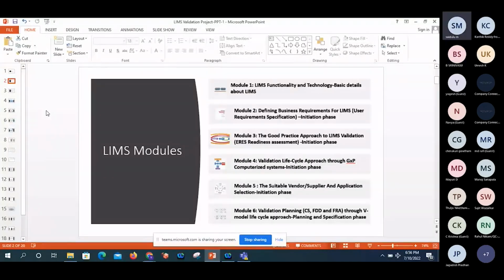Not V model. Nowadays they are asking in interviews at Deloitte or KPMG. They are all asking in interviews. IT industries are asking about agile methodology because they are developers. We are the end users, in pharmaceutical industries, sir. We are configuring our software and using it. So at that time we have to do validation through the V model approach, right, sir?